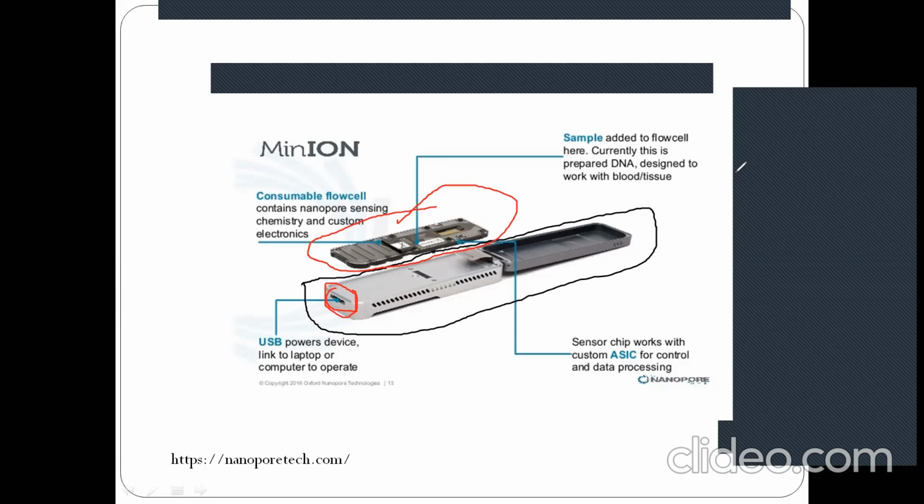But sometimes, due to inadequate cleaning, or because this is an automated system, certain things may happen. Before each and every start of the run, the software will give you an exact idea of how many pores are still free, not choked.